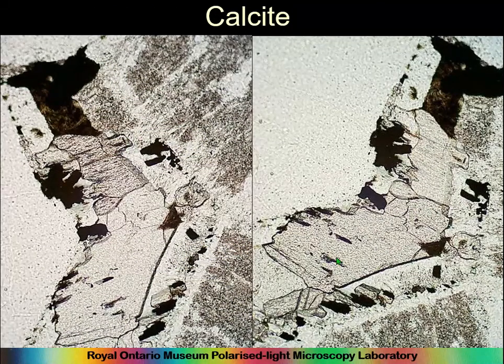But so what calcite does, of course, is that this range of refractive indices, which is quite high in calcite, creates a big difference or no difference at all with the mounting medium. And so when you're looking at it in plain polarized light and rotating the stage, so you're actually perceiving the crystal at different orientations, you will find that an inclusion of calcite may be very high relief or moderately high relief. Then you rotate the stage and it becomes low relief.